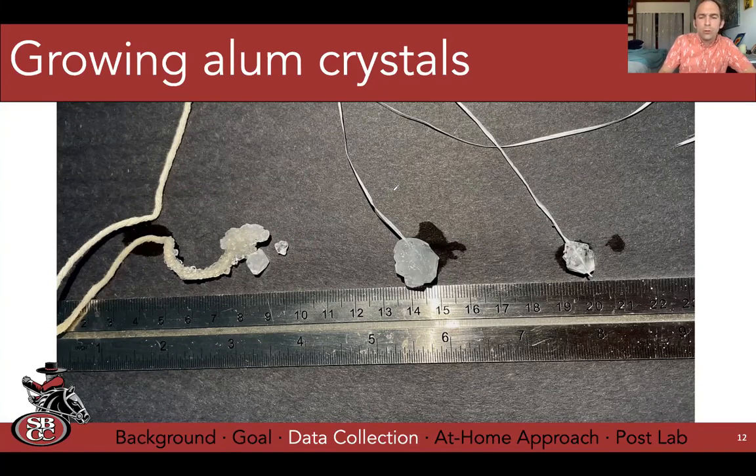And what happened? We grew this crystal at room temperature, so it cooled much faster. And we can see that the crystal is less transparent. That indicates a less ordered lattice. It's larger and it lacks a more defined shape. Our crystal that we grew at a slower temperature gradient has a much more defined shape to it. It seems to be growing more ordered and it's much more transparent. You can actually see the floss sticking through in the middle. And so we know that it's much more ordered here. And so I'm going to say that this crystal is my best effort.